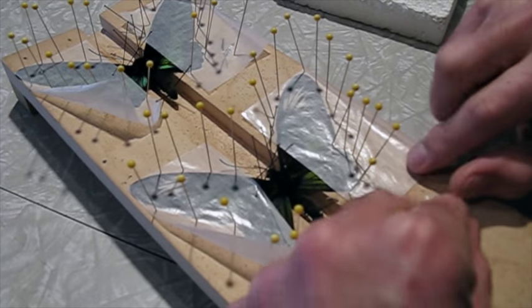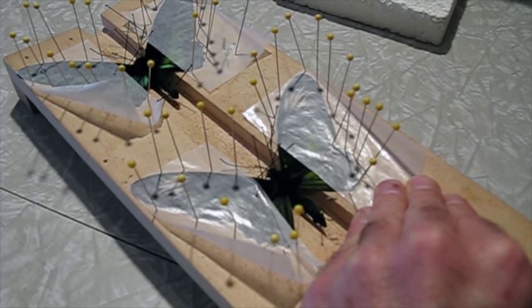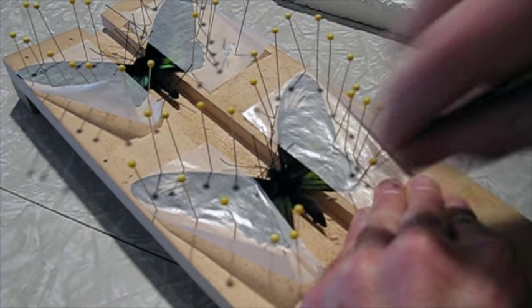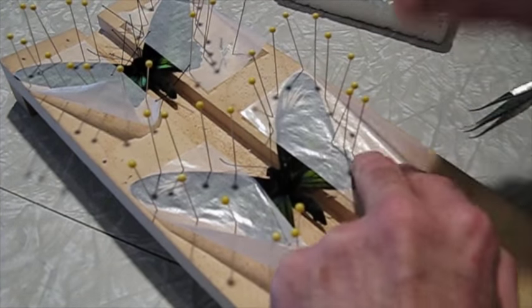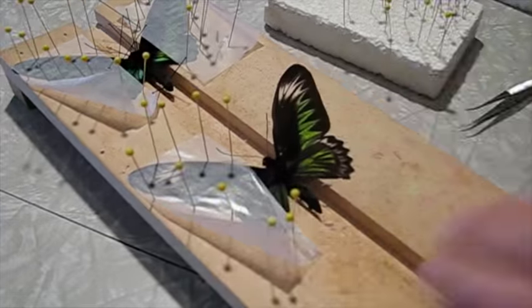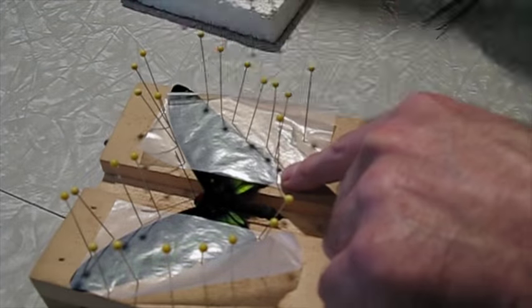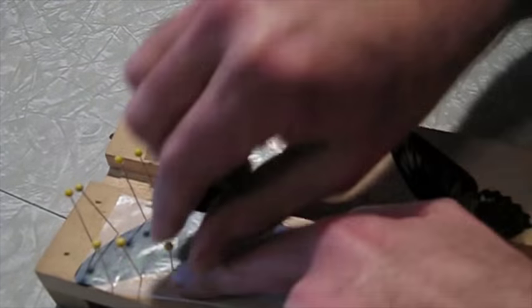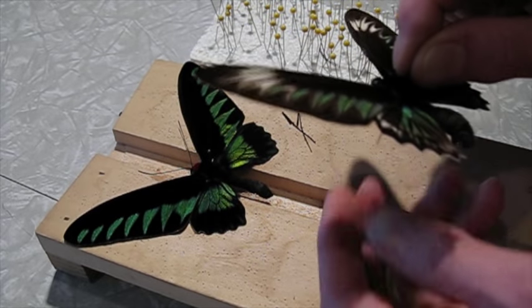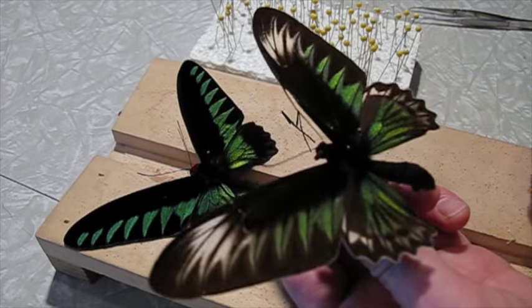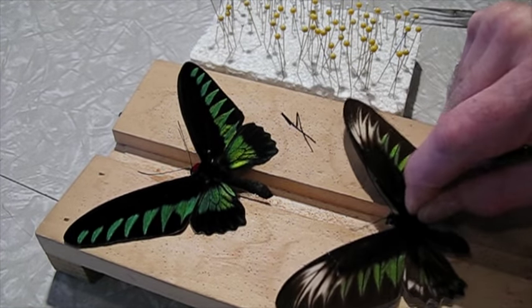These specimens have been sitting for a couple days and they're dry now. We're going to pull the pins and see how they look. Okay, so this is the female, a lot less green on it, white patches on the wings. And the male.